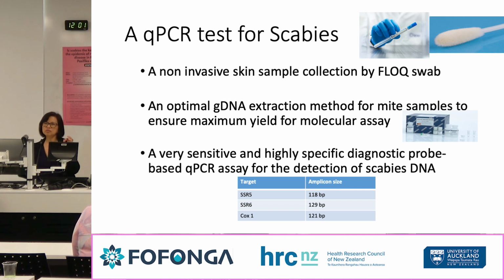You know, in most helminths or parasites, the non-coding region, the one that does not translate to protein, is more abundant. So if you are targeting your PCR at a more abundant region of the genome, meaning the whole genetic makeup of the mite, you will likely increase your chances of getting a positive result because you are targeting a more abundant region.